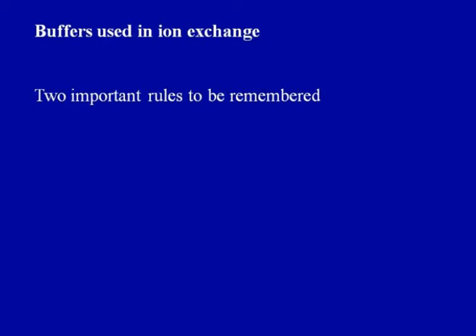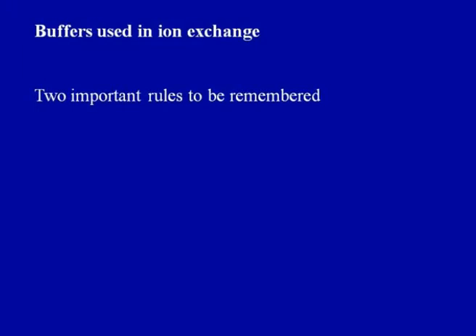Now, buffers used in ion exchange chromatography, again you have to be careful here for successful ion exchange chromatography. In ion exchange chromatography, buffers are chosen in order to minimize pH fluctuations and maximize the adsorbent capacity. Now, two important factors or rules have to be taken care of. One is that the charged form of the buffer should not interfere with the ion exchange process, and we will discuss that. Another factor is temperature, which will affect the pK value of the buffer, such that its buffering capacity will be different in purification carried out in cold conditions.